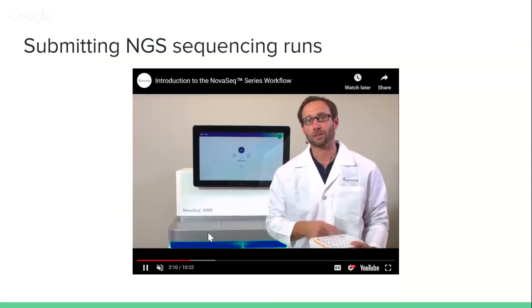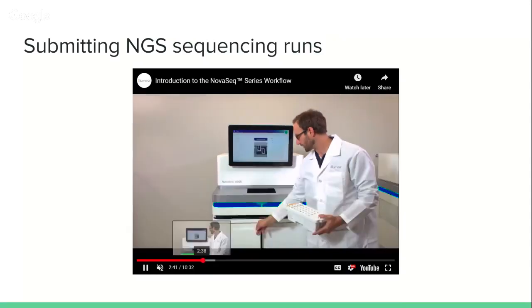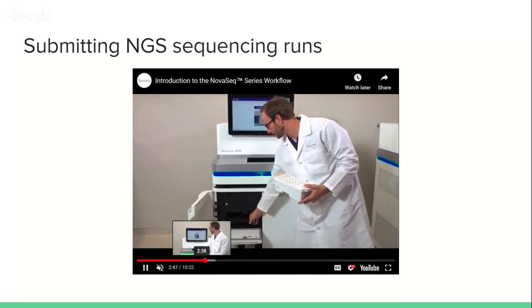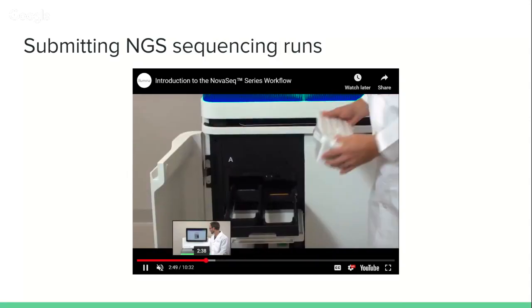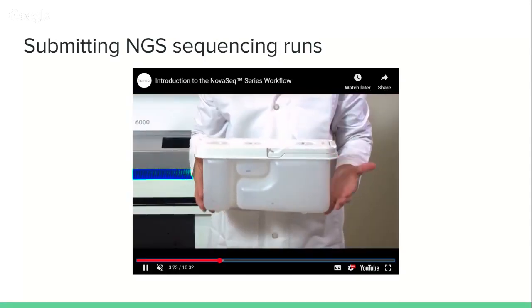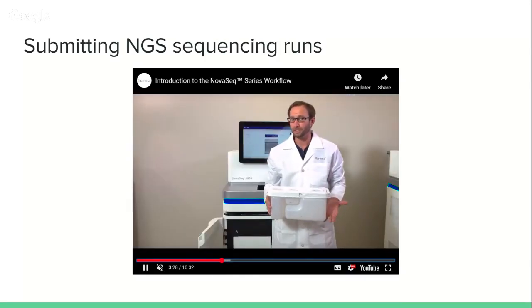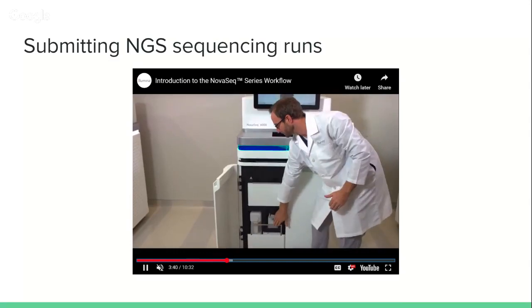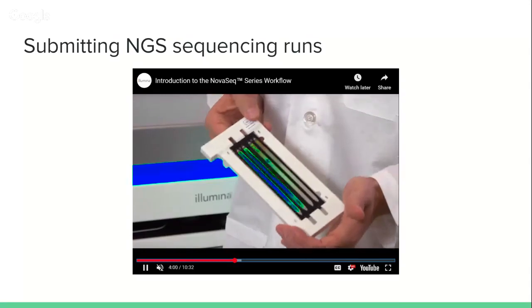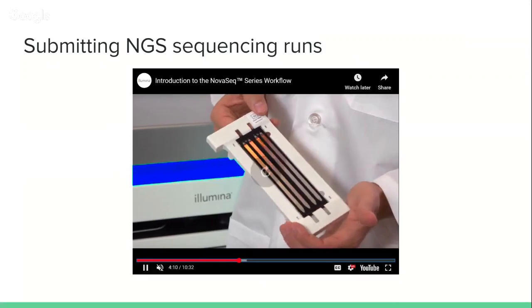Here they're showing the different cartridges, and I think the video shows later on how to pipette your sample into the flow cells. So here is putting the cartridges in. It's really not that much more difficult than putting up the dishwasher if you have a dishwasher at home. The flow cell, very large flow cell for the very highest throughput method available.